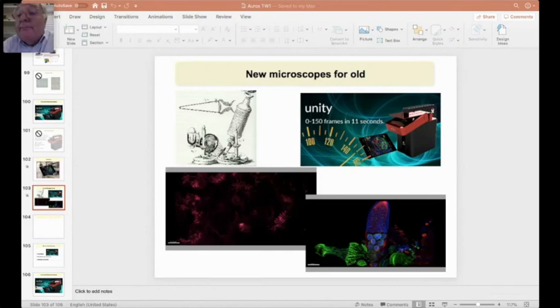Okay, we have a question here that I can probably answer. What is the SOM? Scanning optical microscope. It's one of the older ways of calling it, I guess. Yes, when we started, we always called it a scanning optical microscope because it was a flying spot microscope, and the word confocal didn't come until later. Who coined it for the first time, I don't know. It could have been Fred Brackenhoff, as someone suggests. I really do not know.